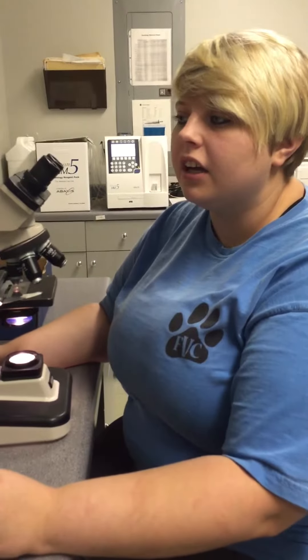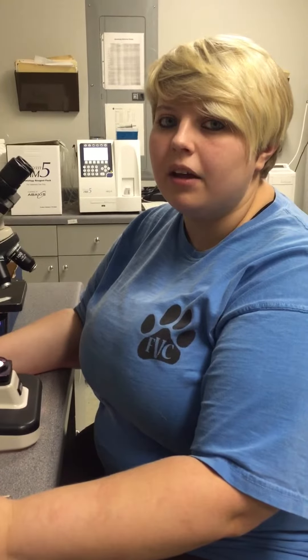It appears that Bobby Sue has some ear mites, and that is a microscopic exam for ear mites.